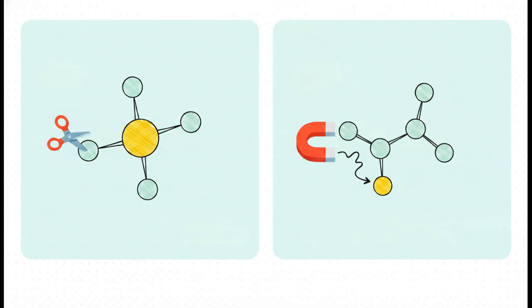Now, high-energy electron bombardment mostly leads to two specific types of breaks. You've got radical site-initiated alpha cleavages and charged site-initiated inductive cleavages. An alpha cleavage breaks the bond that's exactly one atom away from the radical site, whereas an inductive cleavage happens when an electronegative heteroatom essentially pulls an electron pair right toward itself. Ultimately, these two fundamental processes are going to dictate the vast majority of the shattered pieces we eventually detect.